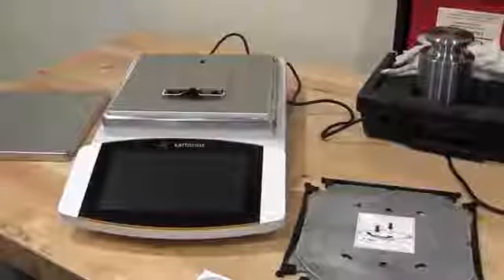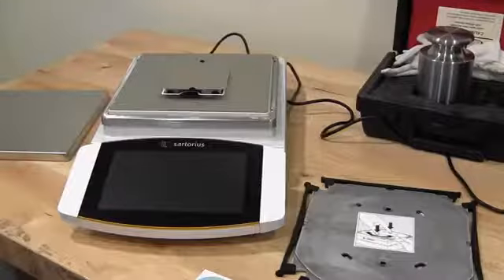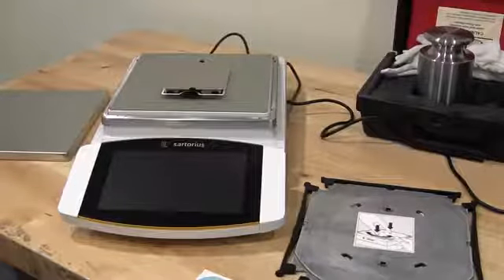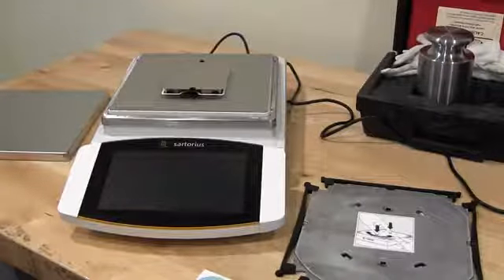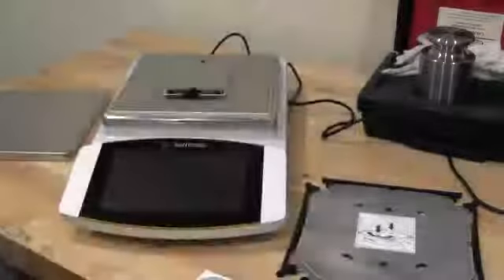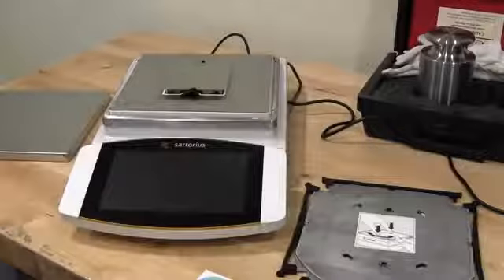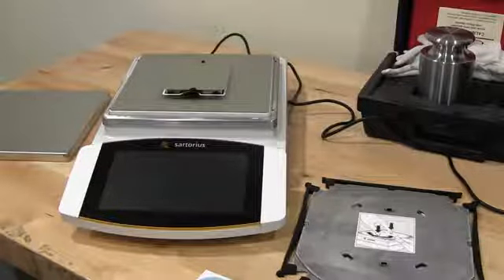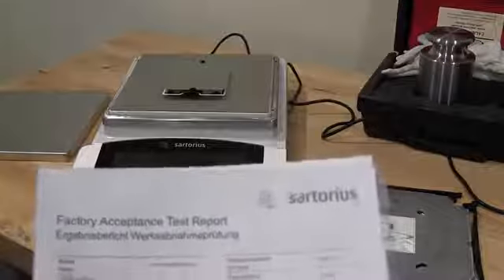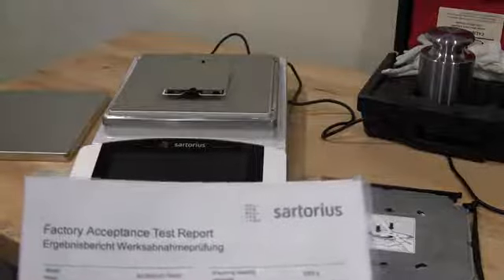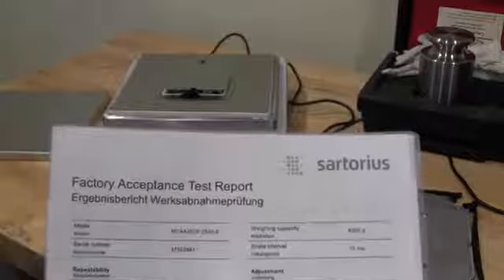I got my hands on a Sartorius Cubis II balance and just wanted to give you a general overview of this. The balance comes with a detailed manual and this particular model is the MCA6202.